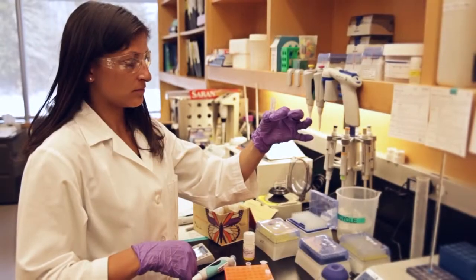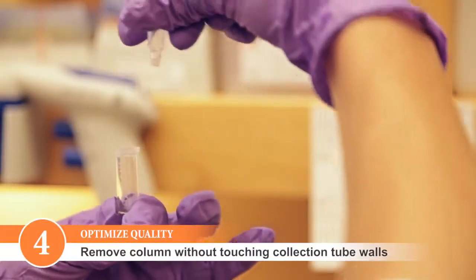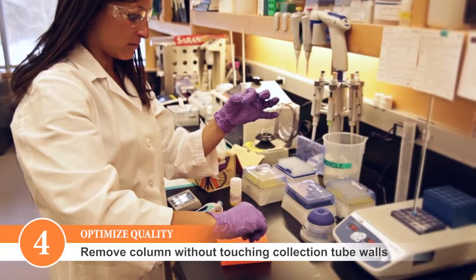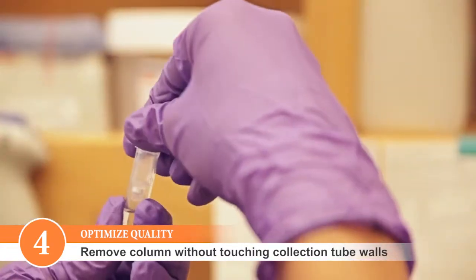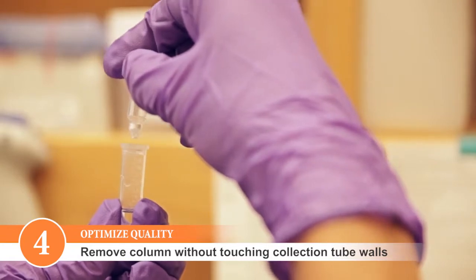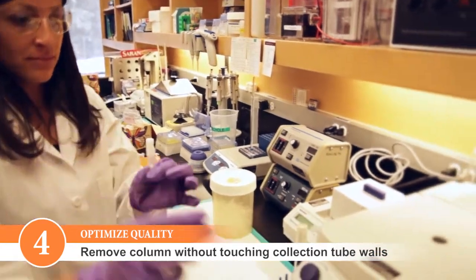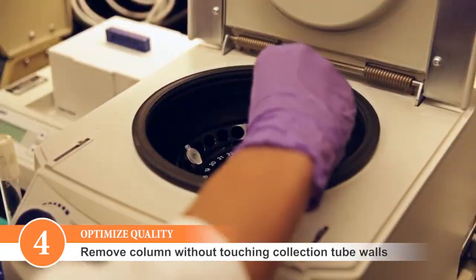When removing the column from the collection tube after the last wash, make sure that the tip of the column doesn't touch the walls of the collection tube. If you observed that the tip of the column came into contact with the collection tube wall, then we would recommend an additional 30-second centrifugation step prior to the elution step.